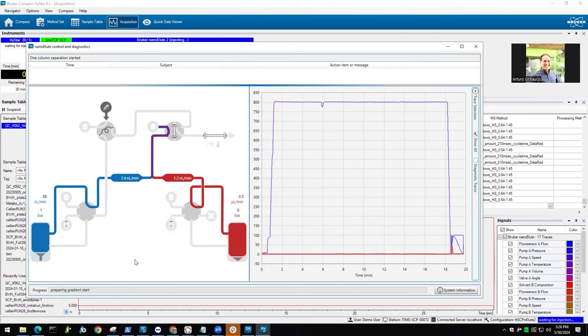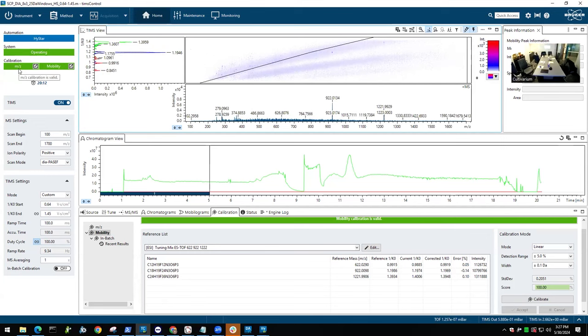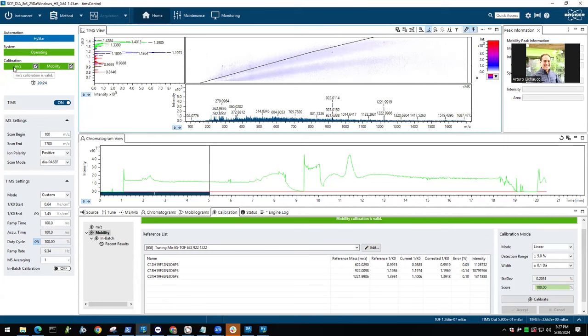Whenever you change anything in the ion mobility settings, if you go narrower or wider, you need to recalibrate. But it would tell you in timsControl, basically, this icon here would turn yellow if you change anything. So if you go narrower, that's okay, because this range is covered. But if you go wider, then it would turn red and would tell you you need to recalibrate. The same as when you haven't calibrated it for a week, this one will turn yellow and say calibration is overdue, please calibrate. Same for ion mobility, it would tell you that as well.